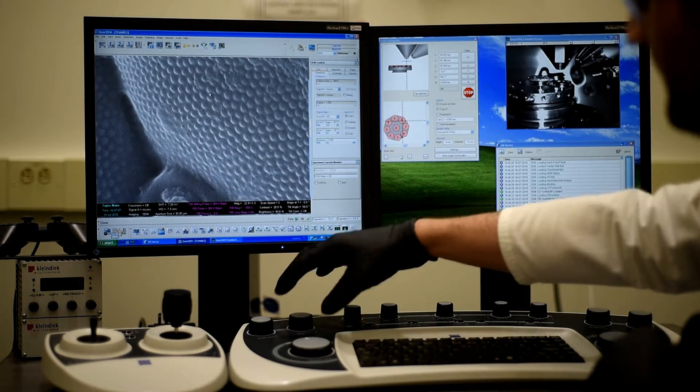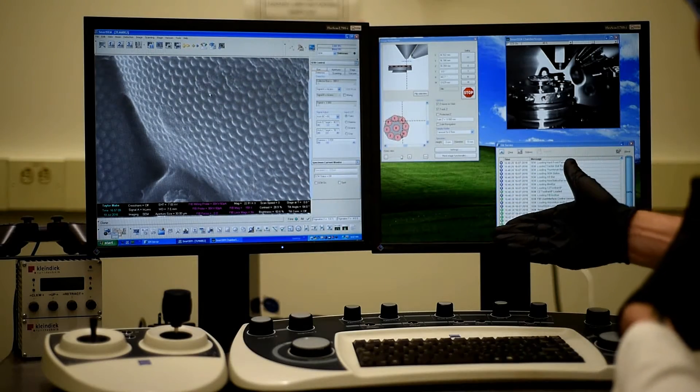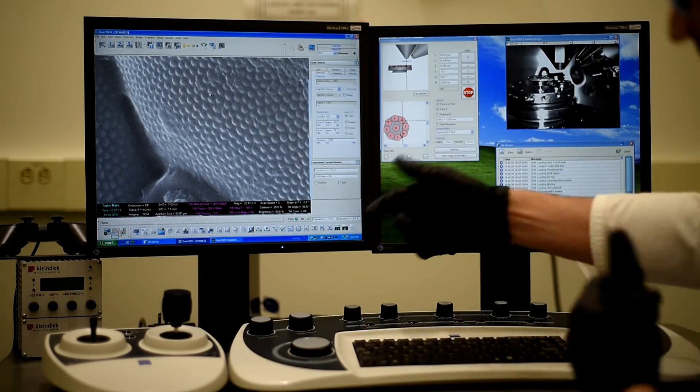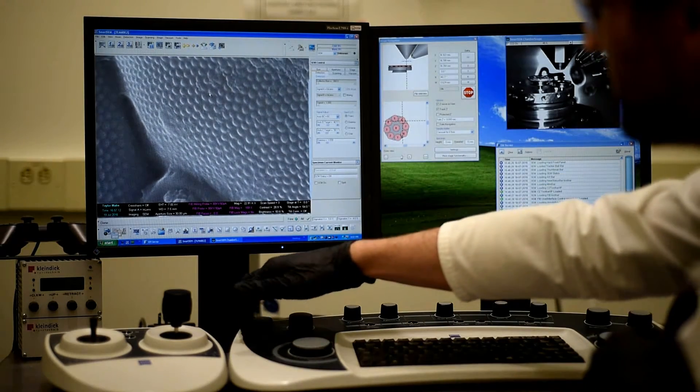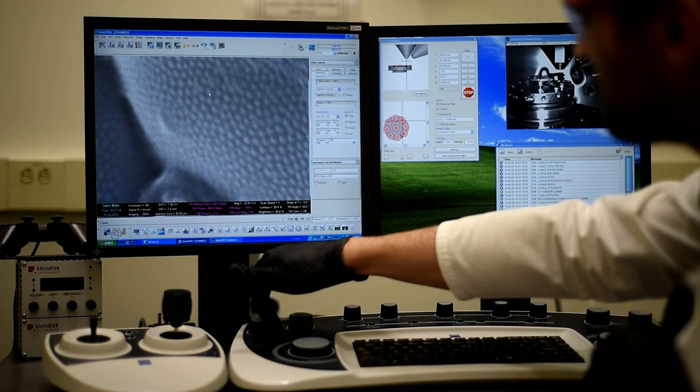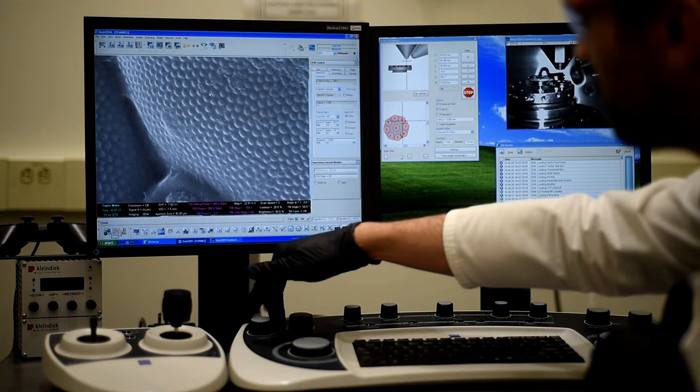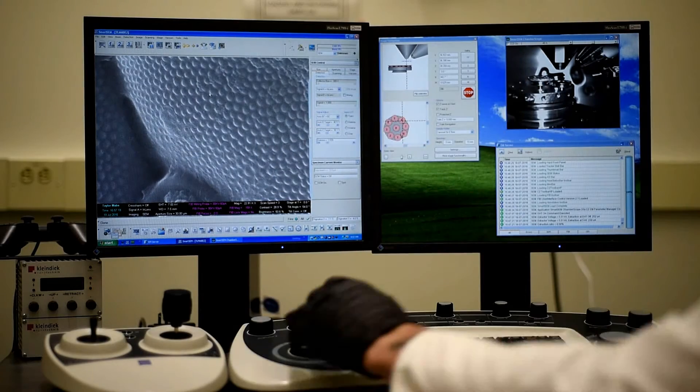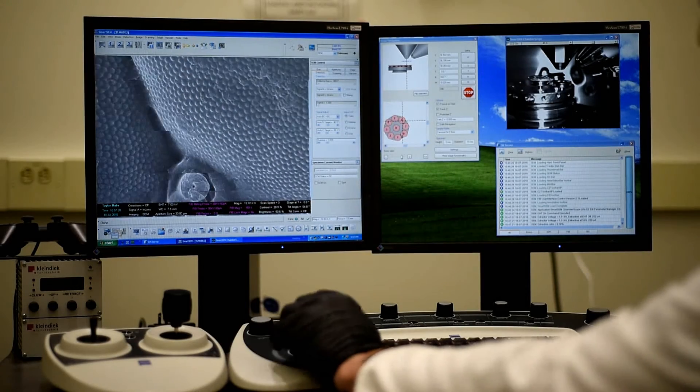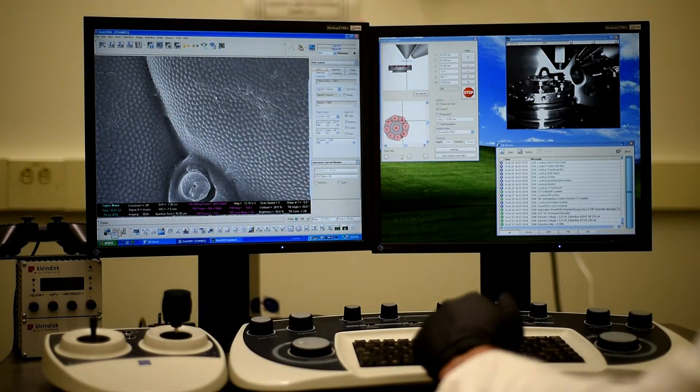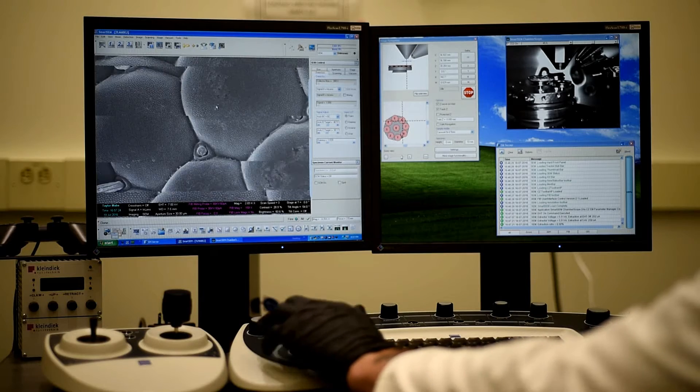So I typically find I go one way, it's messy. Go the other way, it's messy. And then pretty much hit the middle. And we're getting some wobbling there, which is fine for this. So there's with correct stigmation the eye of a fruit fly.